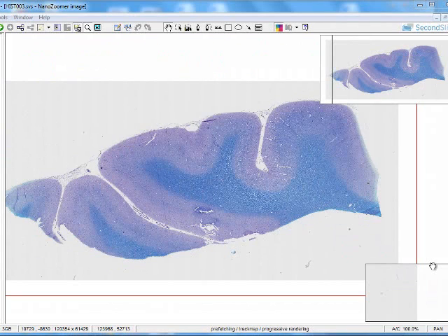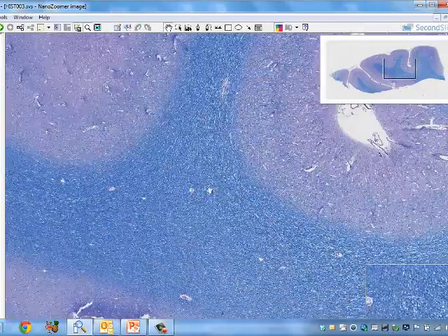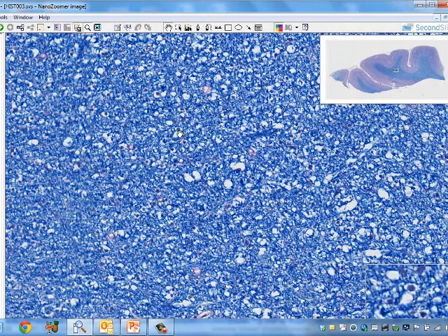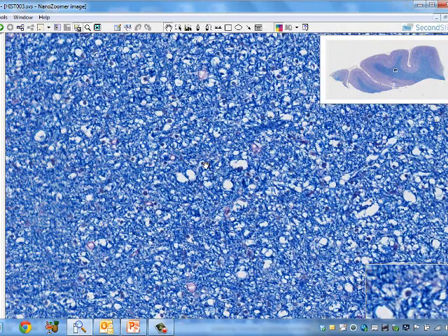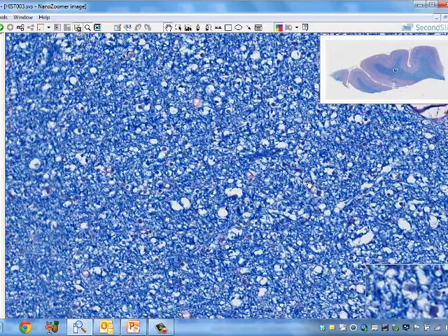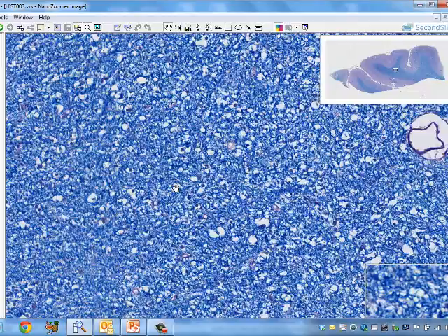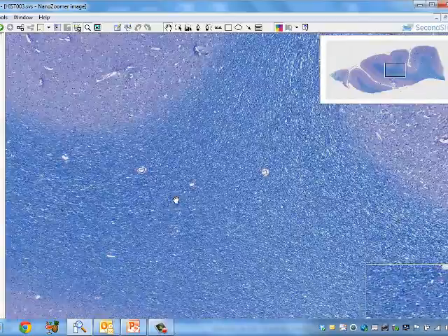So as we look at the cerebral cortex, we see the gray matter on the outside and the white matter in the center. And the white matter is composed of myelinated axons. And you see the axons here. You also see maybe some nuclei of cells or support cells in here, but these are the network that allows communication between the nerves to occur and for the message to go out.